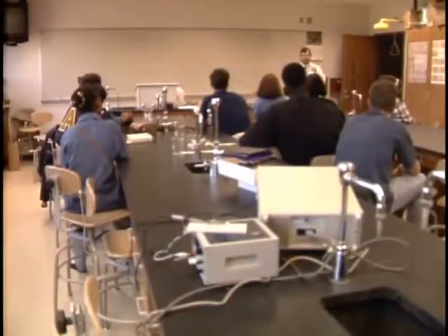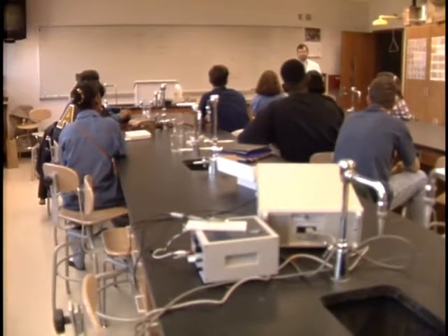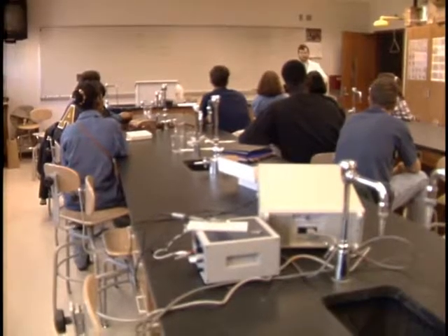It doesn't so much kill it as it just prevents it from growing. Yeah. Now, one of the things we may see may get that type of thing showing up. That usually doesn't show up immediately. It takes 3 or 4 days. So if we take a look at them tomorrow, we'll be able to see, hopefully.